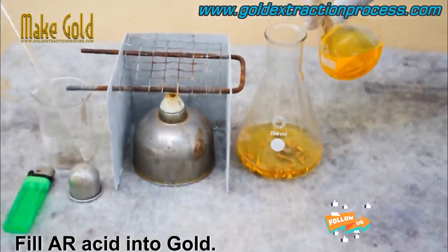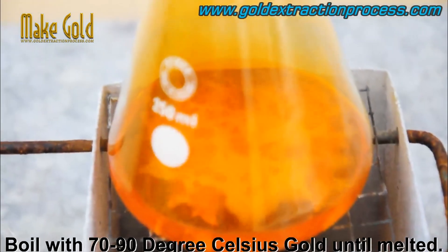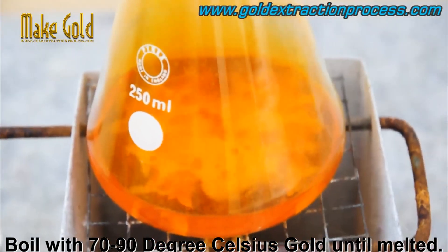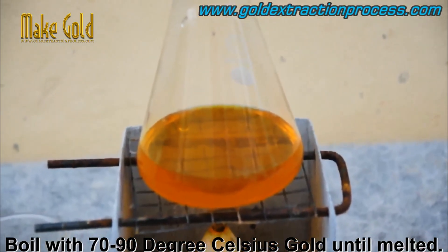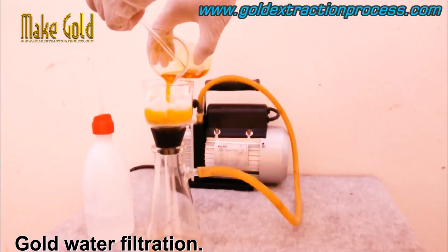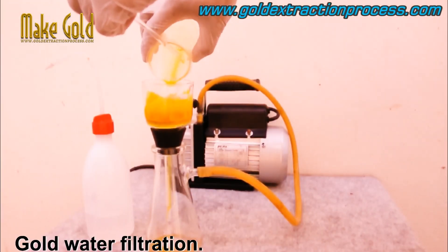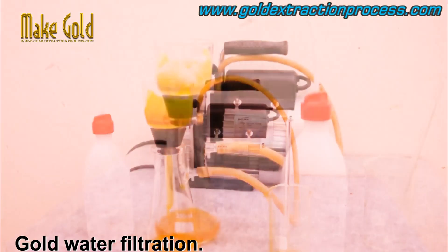Fill the aqua regia acid over the gold and boil at 70–90°C until the gold is dissolved. Aqua regia is a highly corrosive mixture of nitric acid and hydrochloric acid commonly used in gold refining to dissolve and remove impurities from gold.